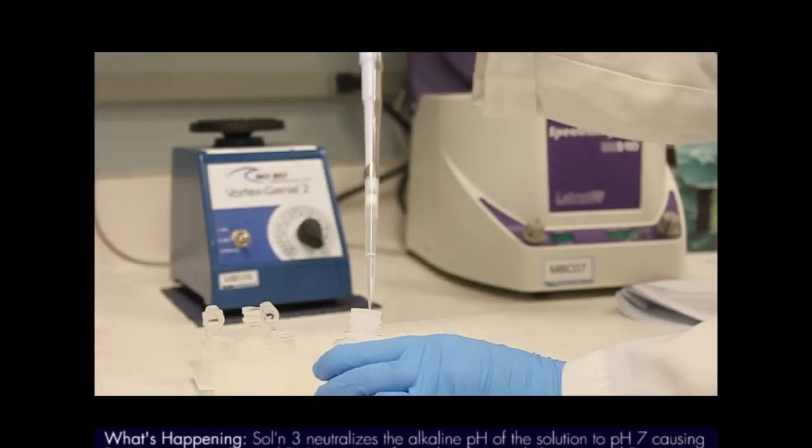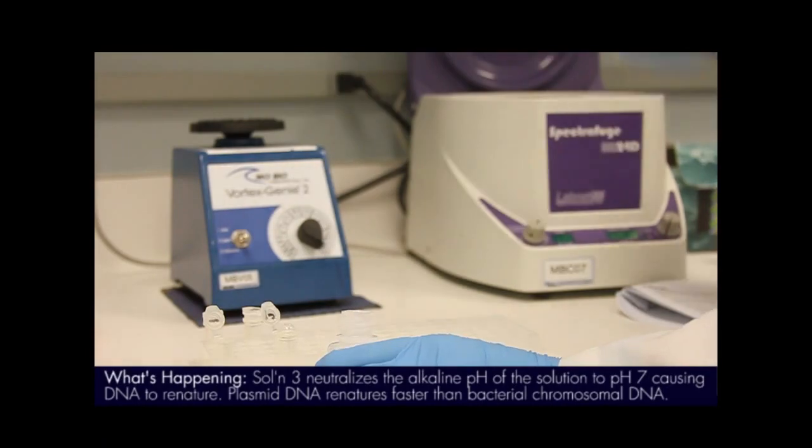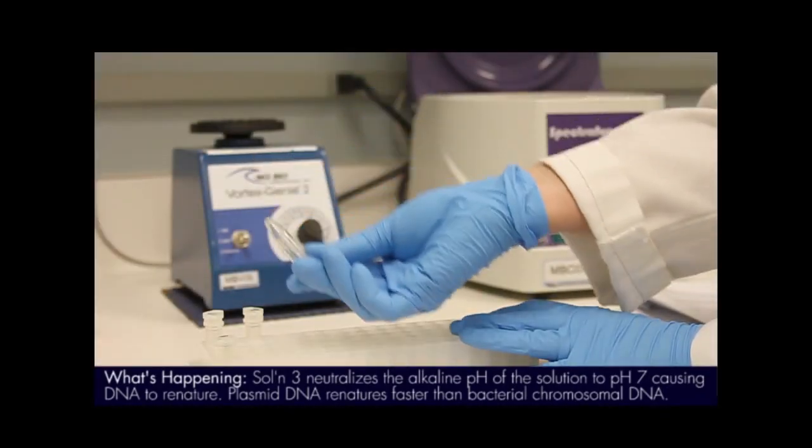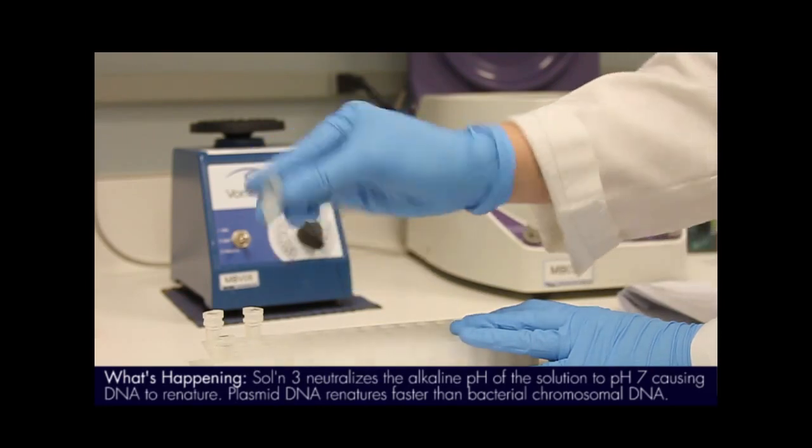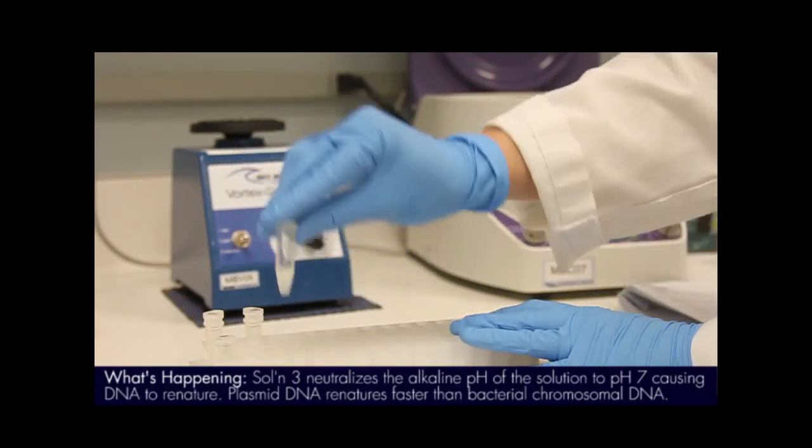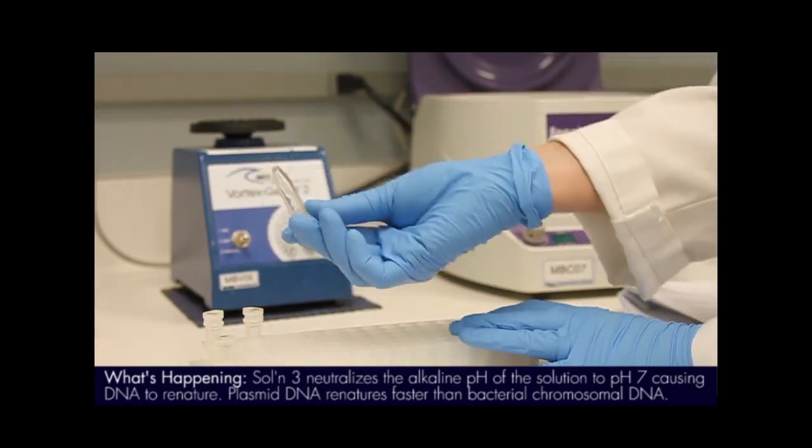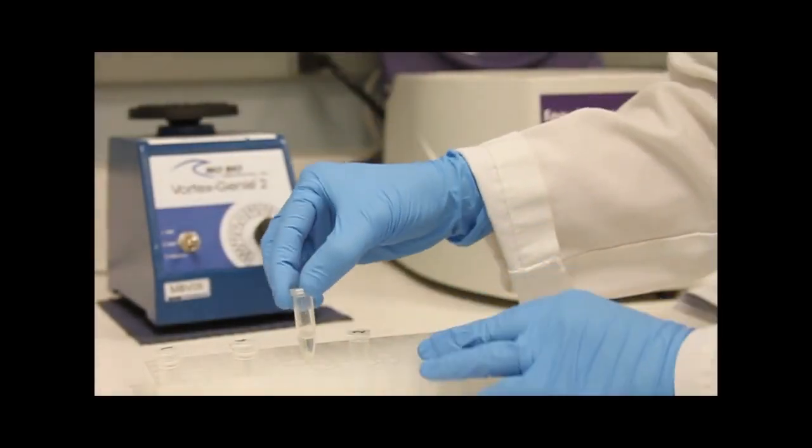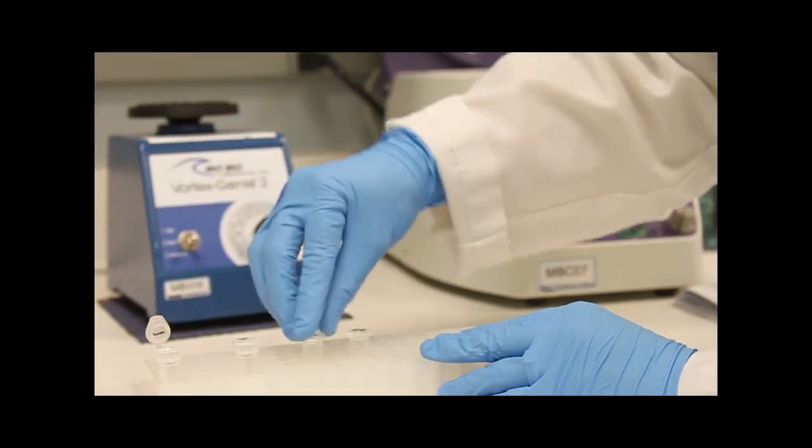Next, we will add solution 3 to neutralize the pH of the cell lysate. Invert 8 times to mix and centrifuge the tubes at 16,000 times G for 1 minute to pellet the cell debris. You should now see clear non-viscous supernatant on top of a large white pellet stuck to the sides of the tube.